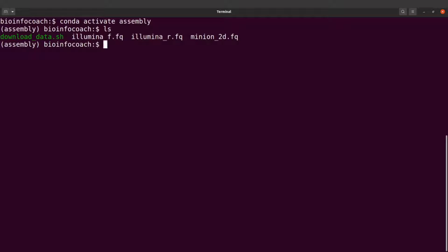Okay, we are back. We are now going to perform the hybrid assembly using Unicycler. What you should note is that Unicycler also does polishing. It uses pilon, so we need to change the Java memory options before we can proceed. First of all, I'll check where pilon is located. So I'll say which pilon. I have that here. So I'm going to edit this and then change the Java memory option. I'll say nano, and then I'll specify everything.